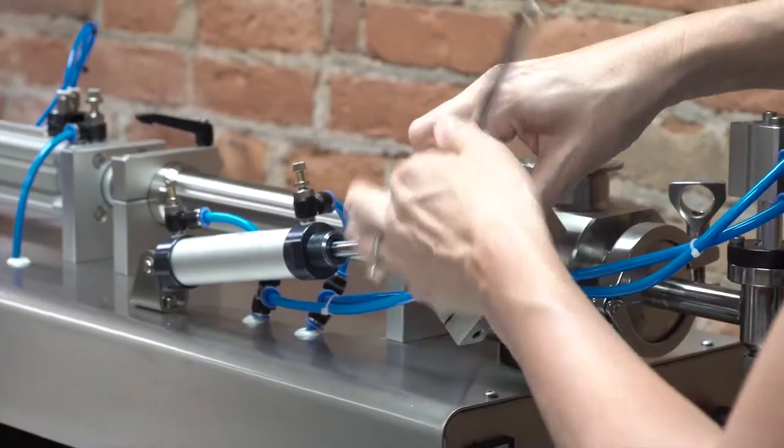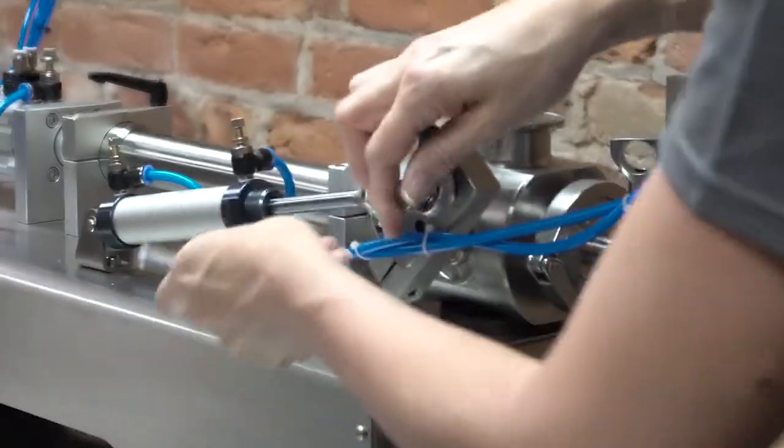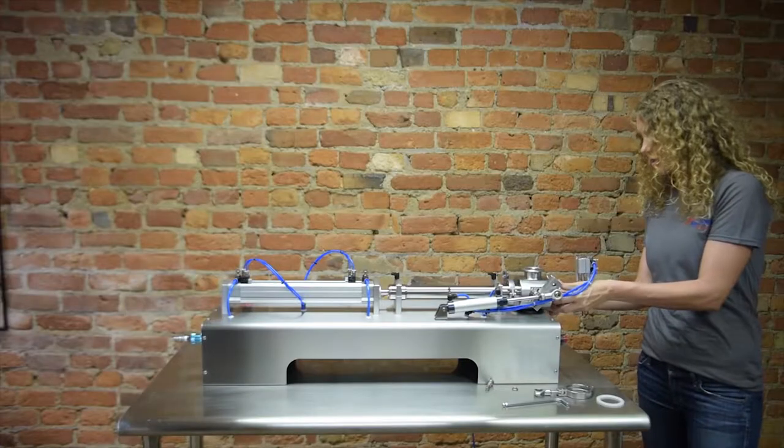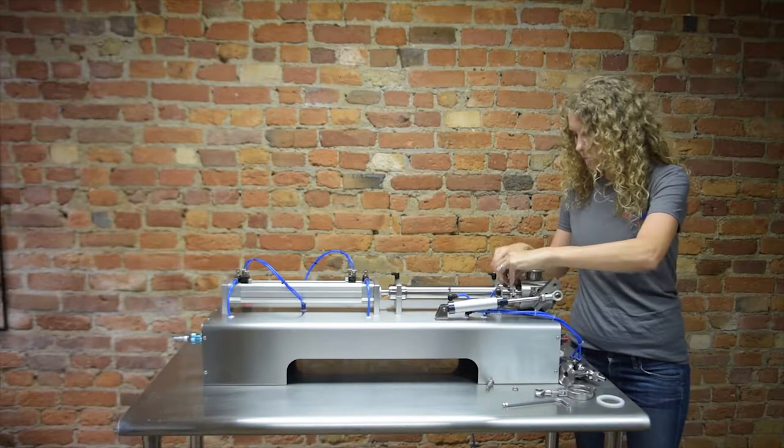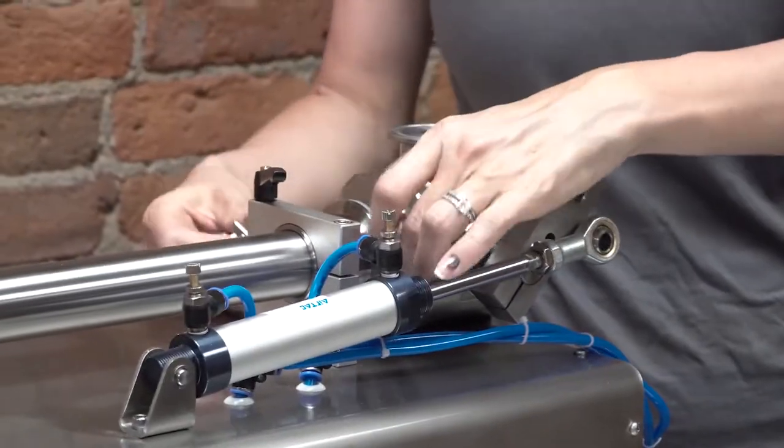Loosen and remove the linkage bolt with an 8mm hex key. Remove the sanitary clamp to remove the fill nozzle. Remove the clamp between the 3-way directional valve.